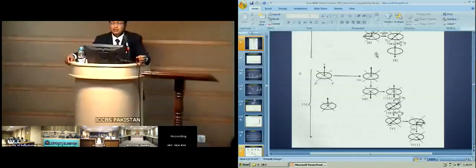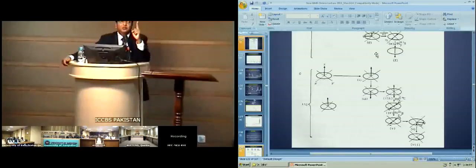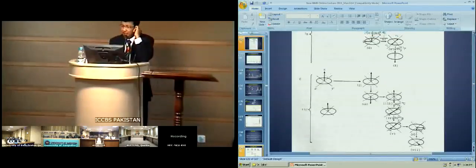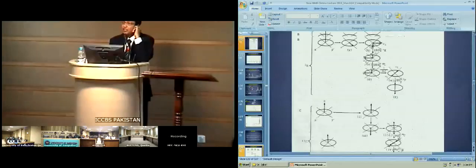I've used this technique literally hundreds of times. You have a big molecule and you want to transfer the population of only one proton to carbon-13. So you do everything on a selective population.